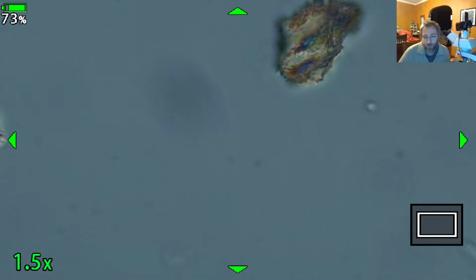We'll take little mini beakers and put them in water, and then if the sample gets kind of hot, we'll just drop it in the beaker and let it cool off. It'll be like a beaker with cool water with a vial with the hot stuff in it, and that usually cools it off. And if it doesn't completely cool it off, that's actually okay. It'll spill out of the little vial into the beaker and still get caught.